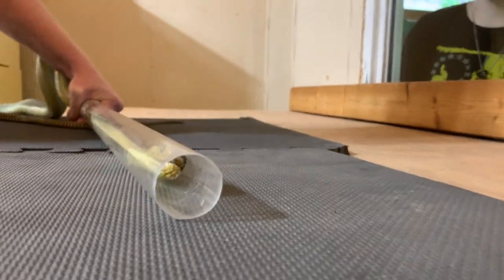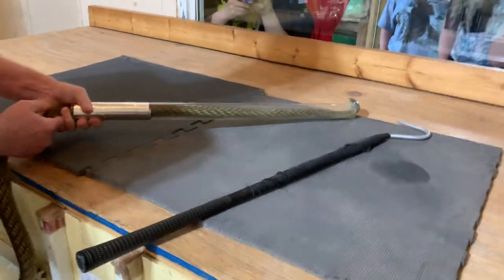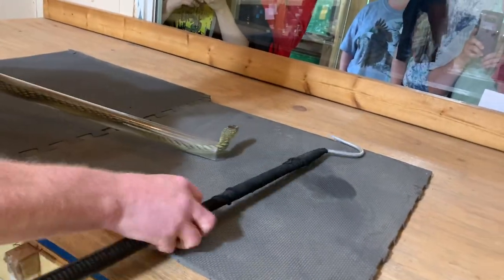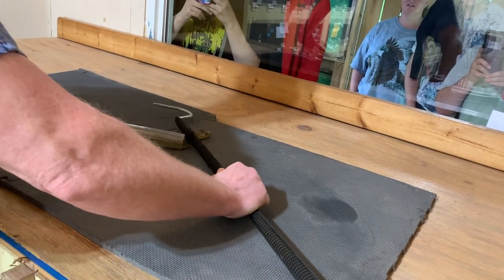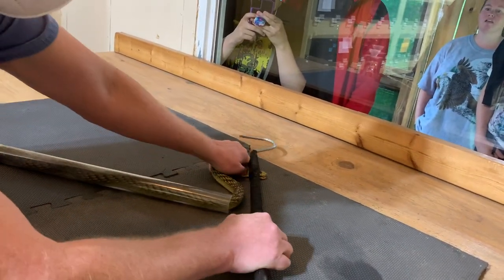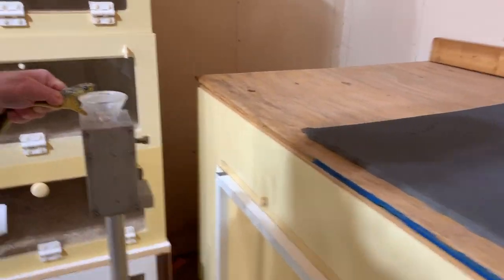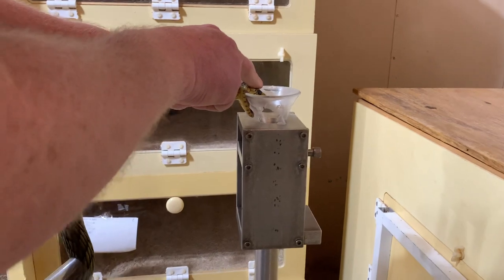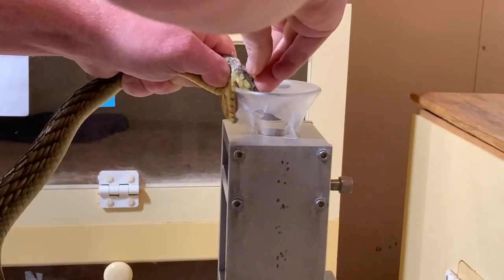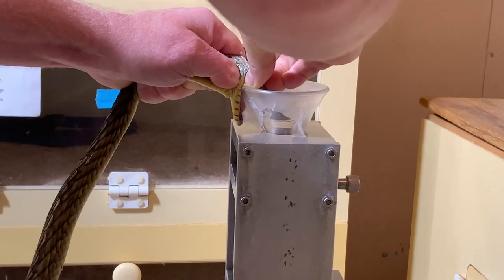Sometimes they don't understand that when the tube is clear they can't go out the side — snakes seem to have a hard time understanding things like glass, plexiglass, or in this case acrylic. And you can see the snake biting down with some of the venom coming out quite clearly right there.